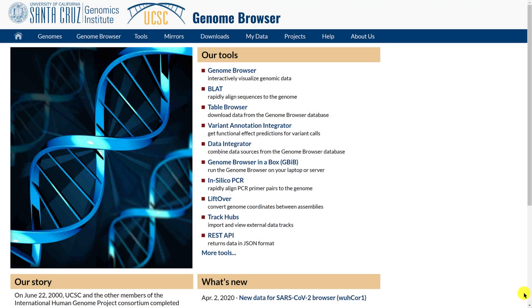In this video I'm going to take you through how to change the display of the UCSC genome browser to make it look as nice as possible for your screen and to make your outputs look as nice as possible. I'm going to show you the many ways in which you can navigate the genome using the UCSC browser so you should be able to find your way around after this short tutorial.